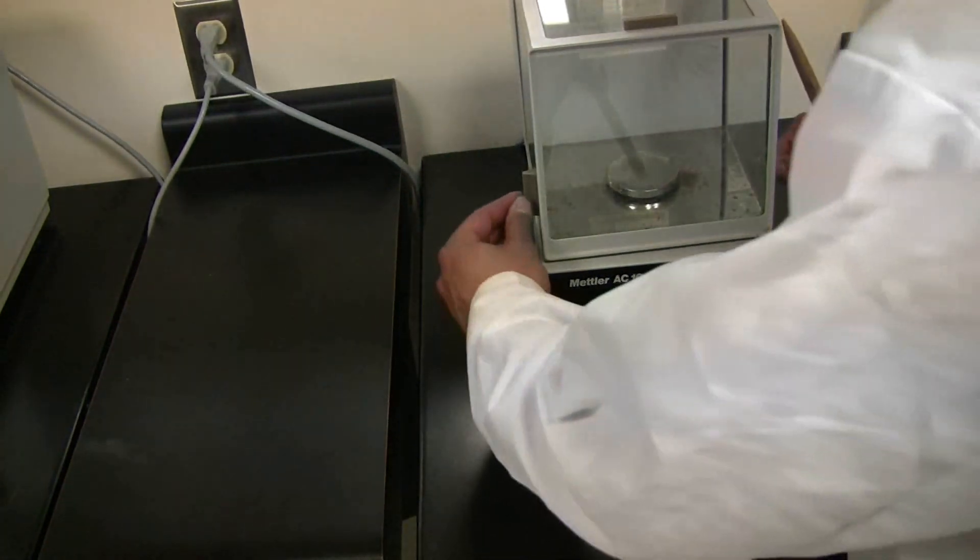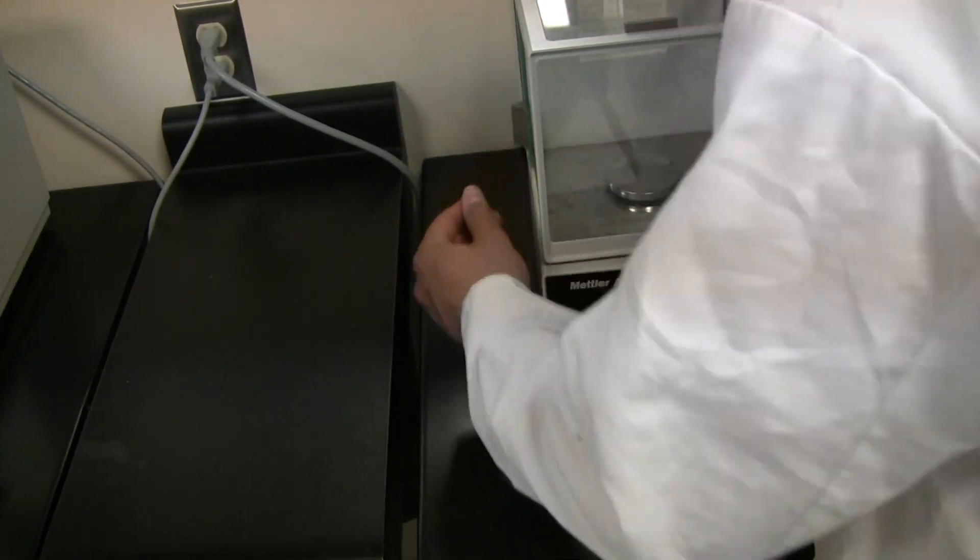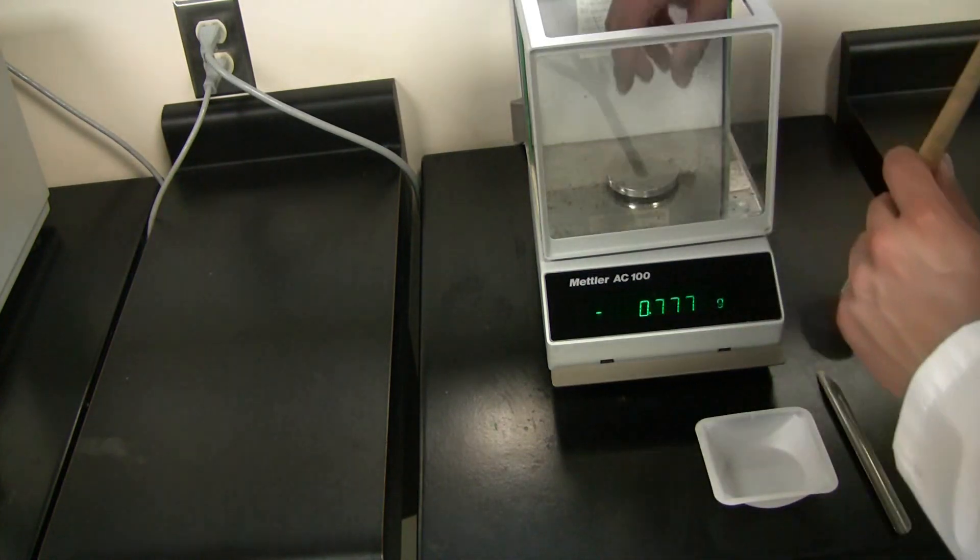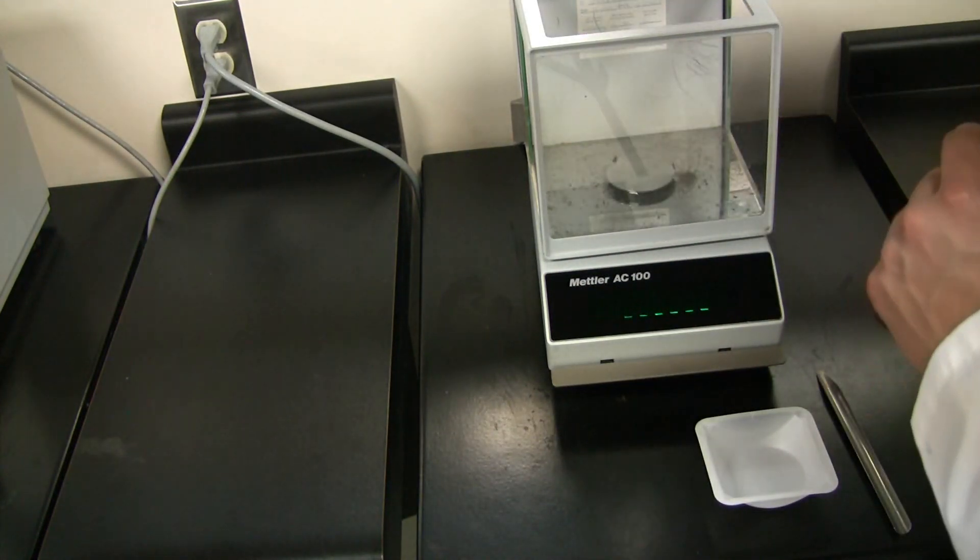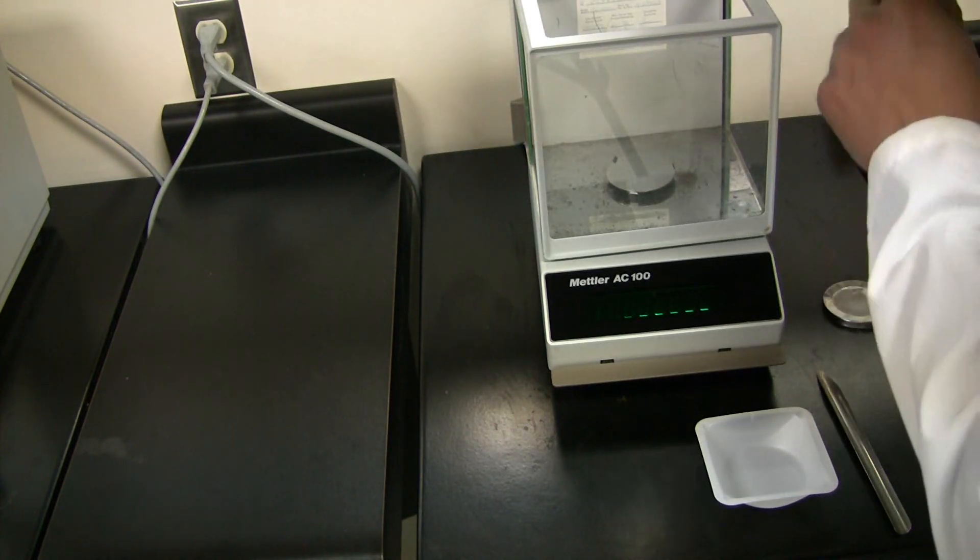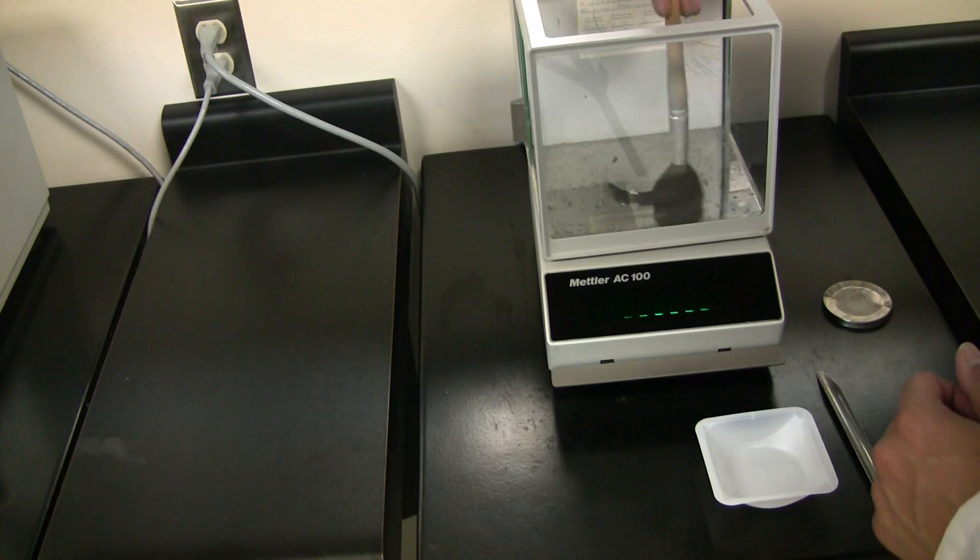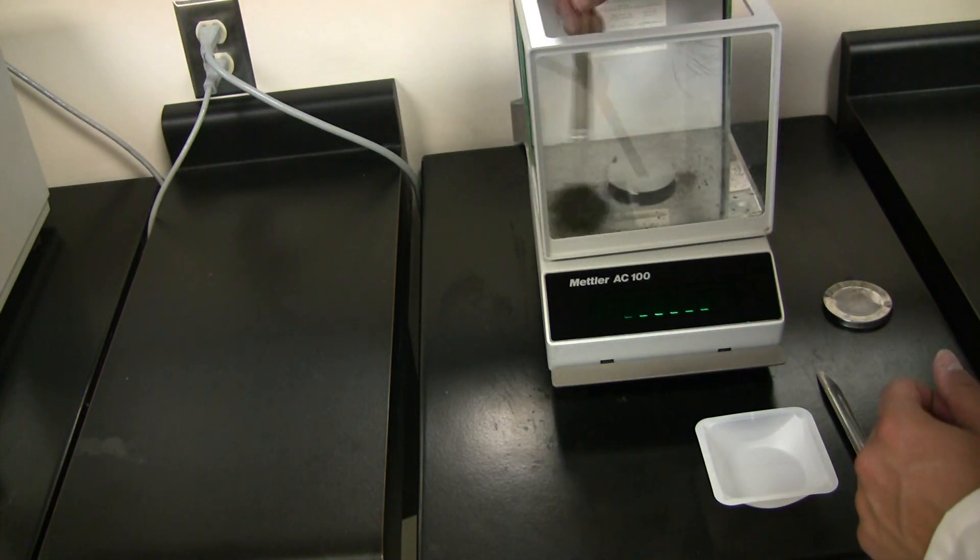Start by opening all three sides of the analytical balance. Take your brush and gently brush off the top, then remove the top plate and continue brushing very lightly over the sensor and all around to remove any debris that could be present.